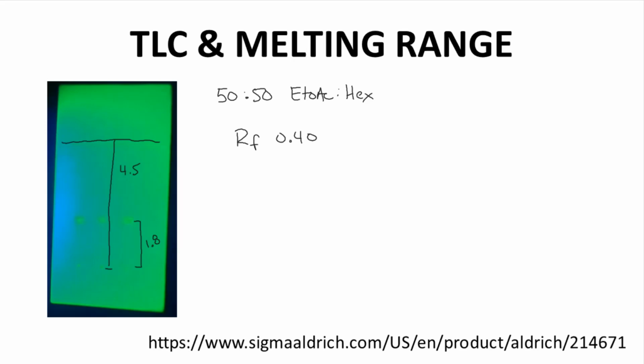There is a bit of a streak toward the bottom of the plate. The TLC looks fine, but it's not the best start. Of course, this product is technically a crude product. This material has not been recrystallized, distilled, or chromatographed. The product just formed as a solid and was filtered. This is a crude product. How about the melting point?